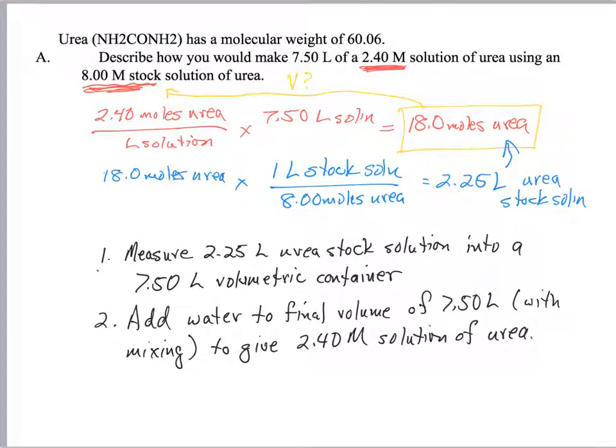So, I hope this was helpful. This is two ways of making a solution of a known molar concentration. Once from the solid of the solute, and once if the solute is already dissolved in a stock solution of higher concentration than the solution that you want to make.